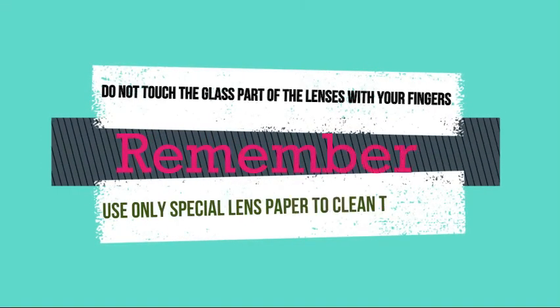Number 10. Do not touch the glass part of the lenses with your fingers. Use only special lens paper to clean the lenses.